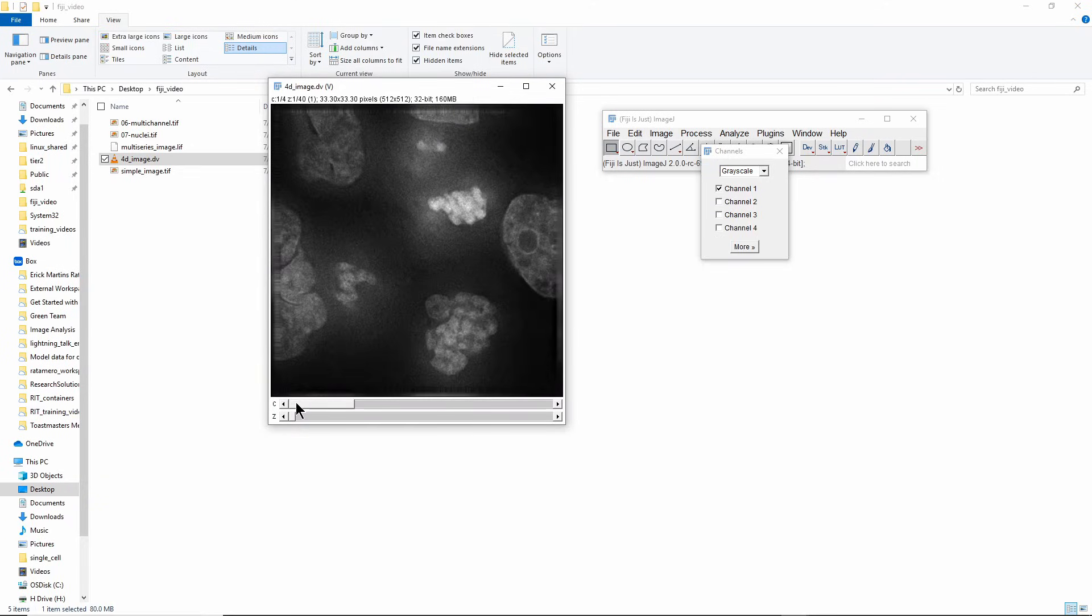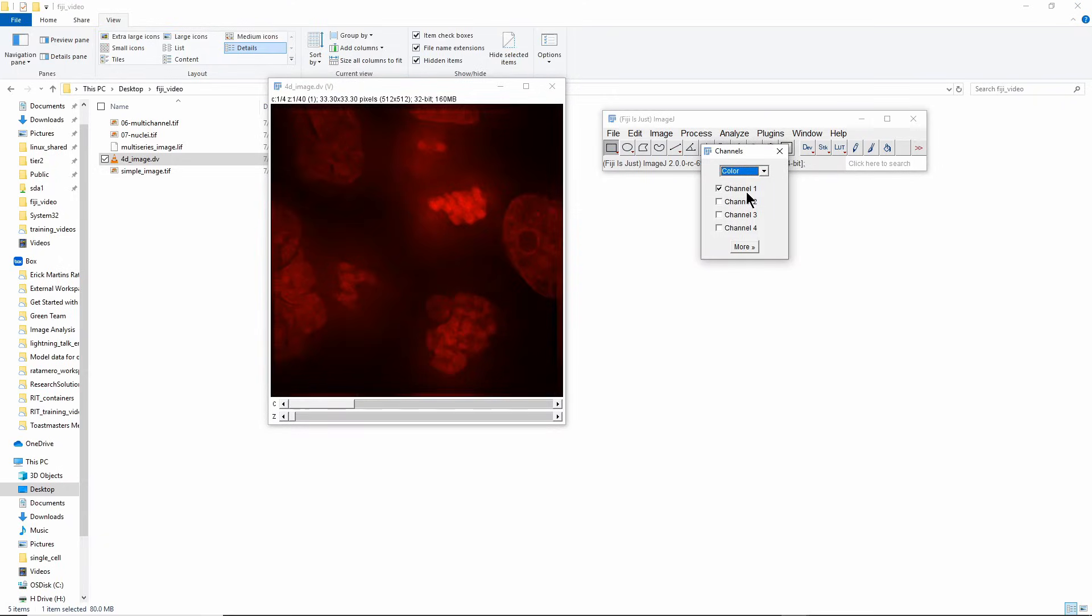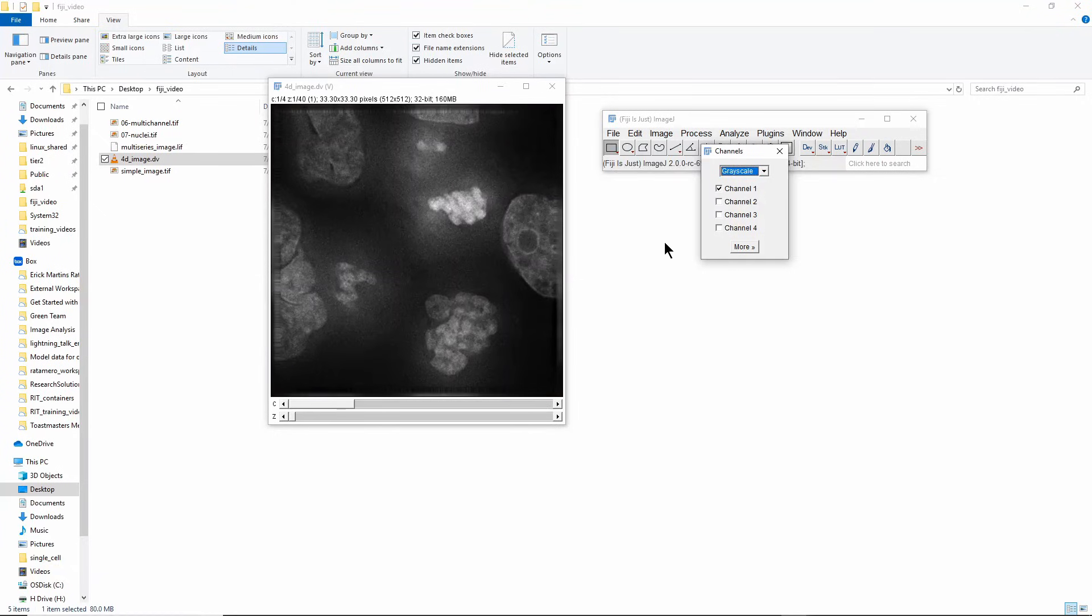You can see that especially here in this first channel, if I change this to Color you'll be able to see less detail than when I have Grayscale. I think that's particularly visible especially here on the right hand side. So I'll change it back.